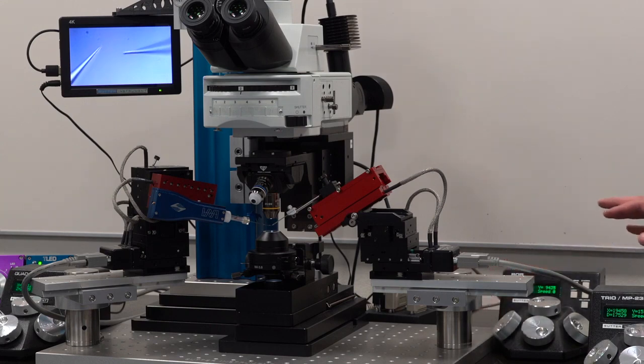Again, a little bit of a busy setup, but some people do prefer these controllers to be separate for the different pipettes and the whole microscope.